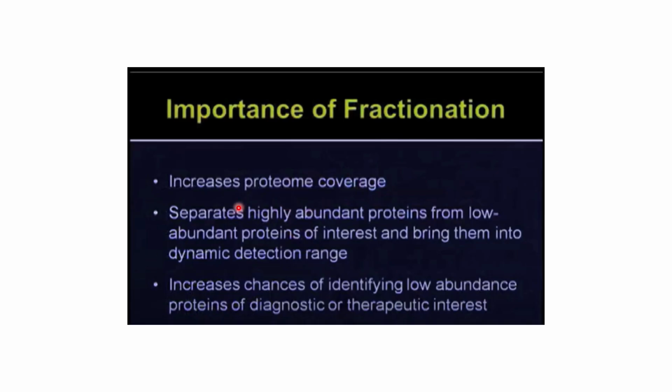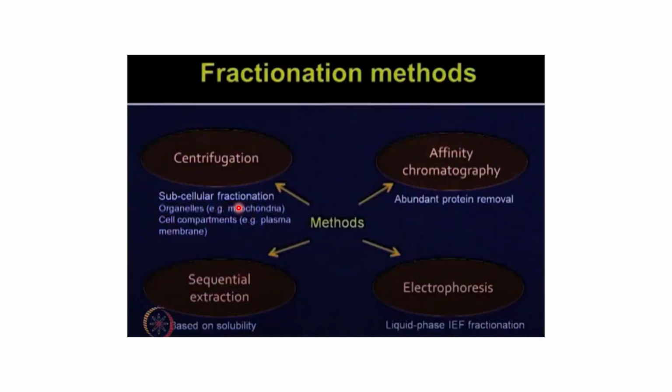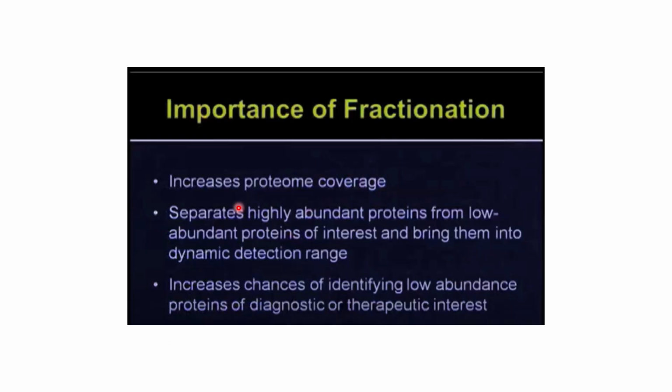So a lysate will have all different types of proteins together. You can separate it on the basis of different techniques, and each and every fraction can then be analyzed separately, which becomes easier, and the analysis becomes much easier to do basically.